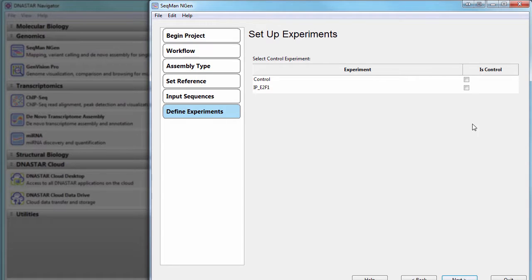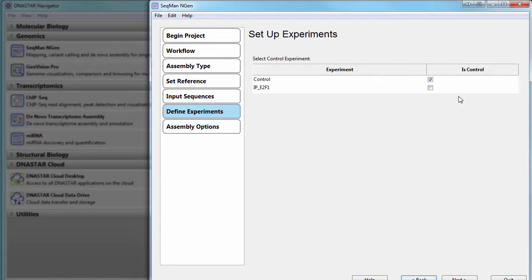Next, I'll just specify which experiment is my control. During assembly, the ChipSeq peak detection algorithm will subtract out the control signal to identify experimental peaks that rise above background noise.